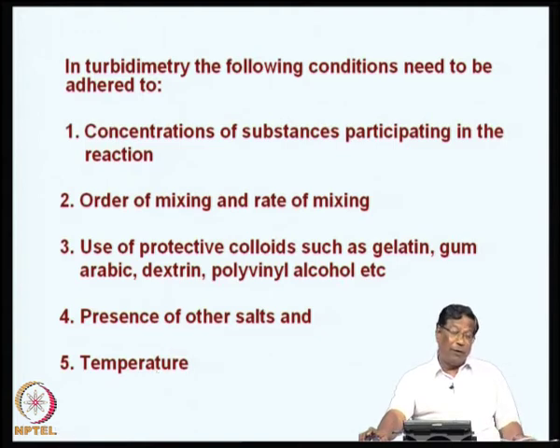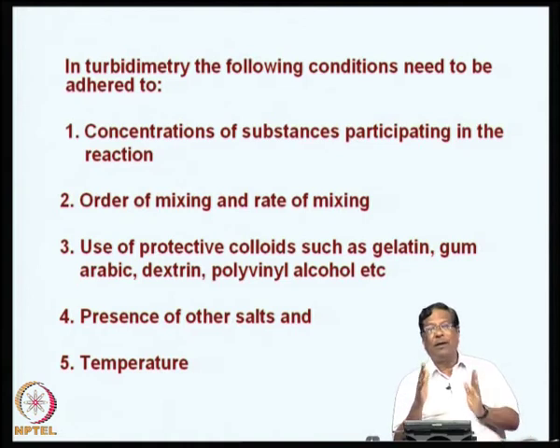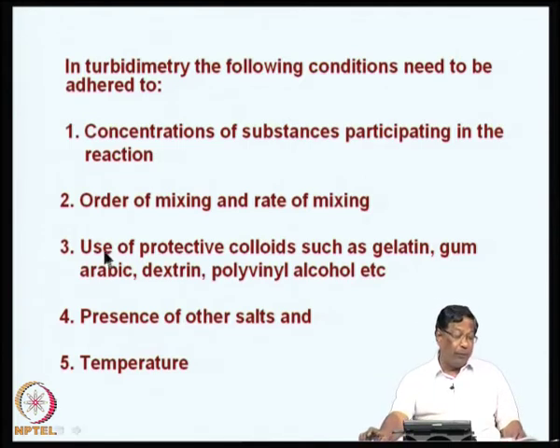The temperature of course influences the particle size to a very large extent, and the temperature of the reaction must be maintained constant, like using an accessory with a flow through cell in which the sample is contained in a cell where the cold water is circulating, so that you can control the temperature up to 0.1 degree centigrade.